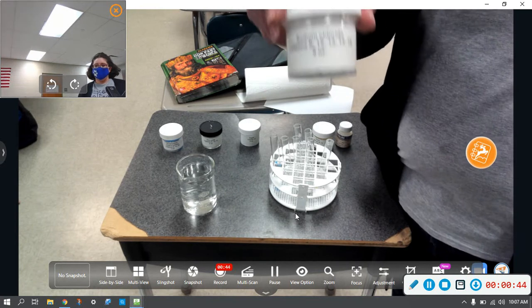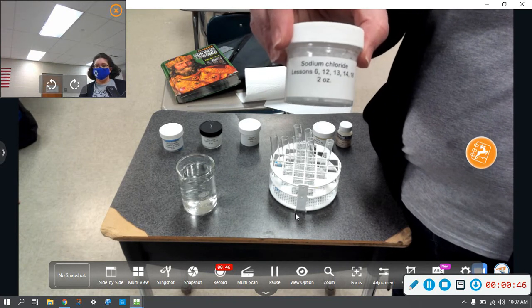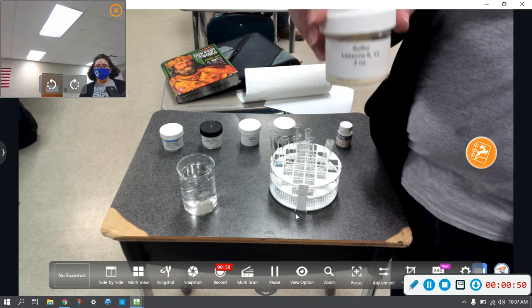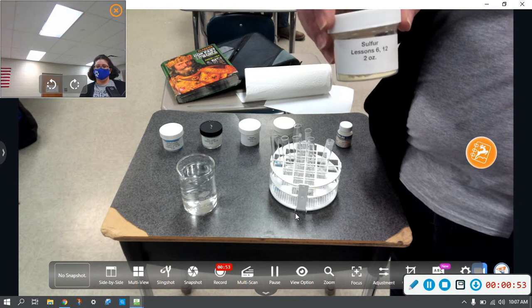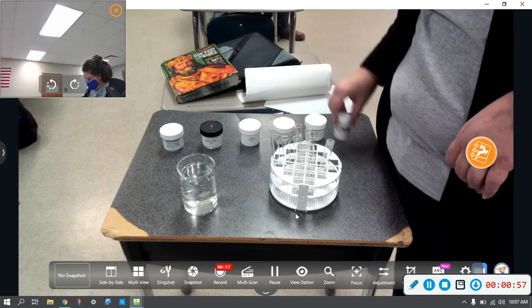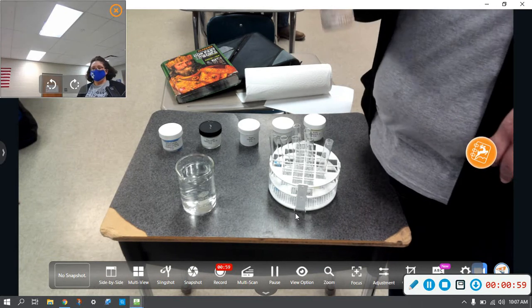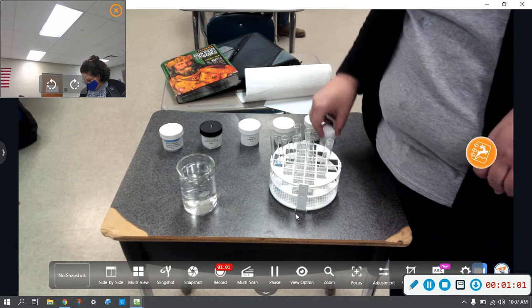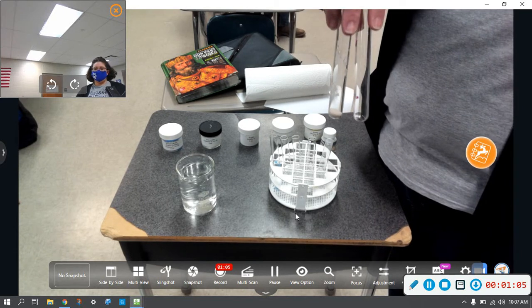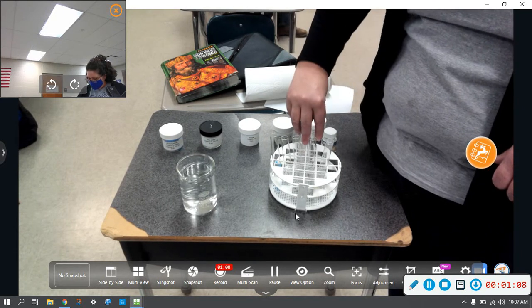And we've got sodium chloride. Then we have sulfur. And then I've got two other substances, potassium permanganate and sand, that we are also going to be adding water to, that are listed on your sheet.